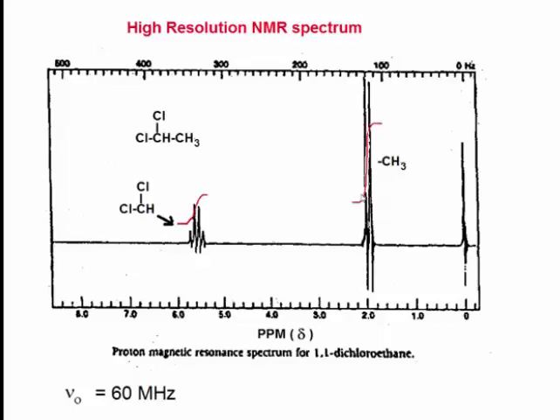The methyl hydrogens in the molecule as signal protons are neighbored by the methine hydrogen. So this signal is due to the methyl group. The methyl protons in the molecule are neighbored by the single methine hydrogen. The single hydrogen is going to exert a magnetic effect on the methyl signal. And as we'll explain, that causes the methyl signal to be split, in this case into two peaks.